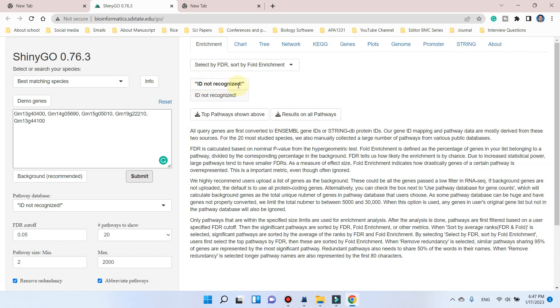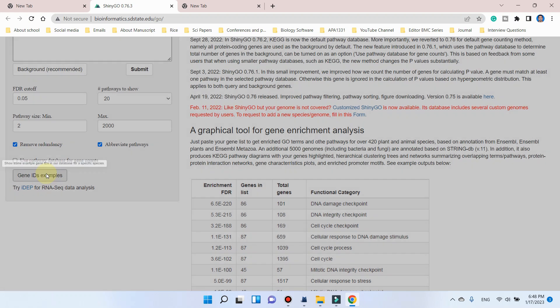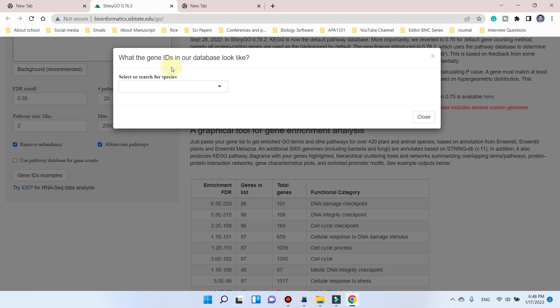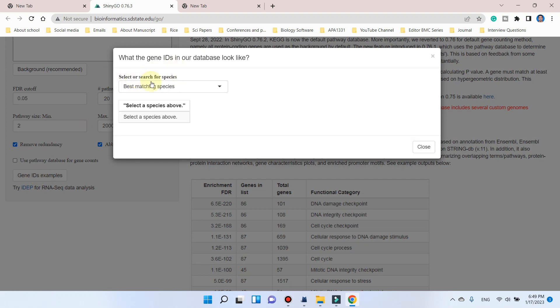So students are interested to know which type of ID we should place here so that this tool can easily accept this. The simple solution for this question can be accessed through this gene ID example tab. You can click on this one and try to search and select your matching species on which you want to perform your gene enrichment analysis.